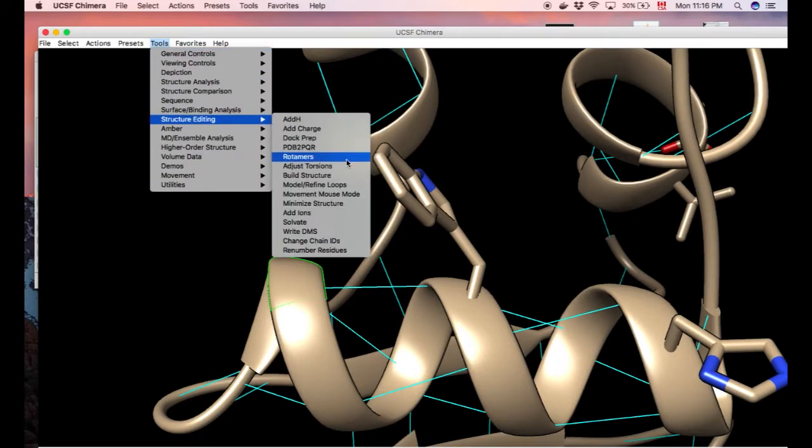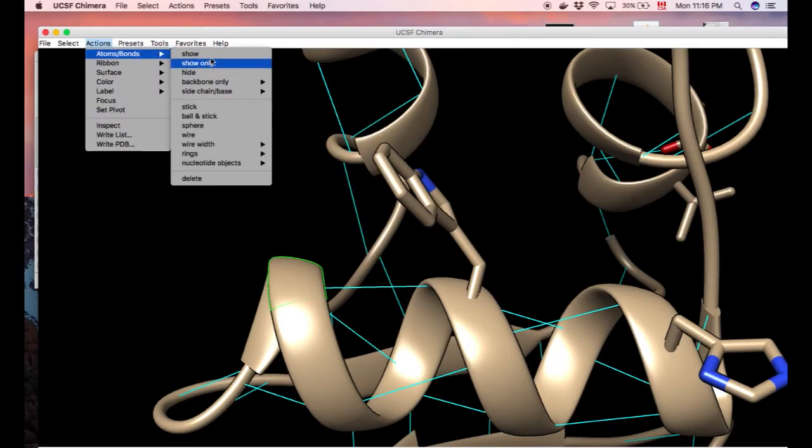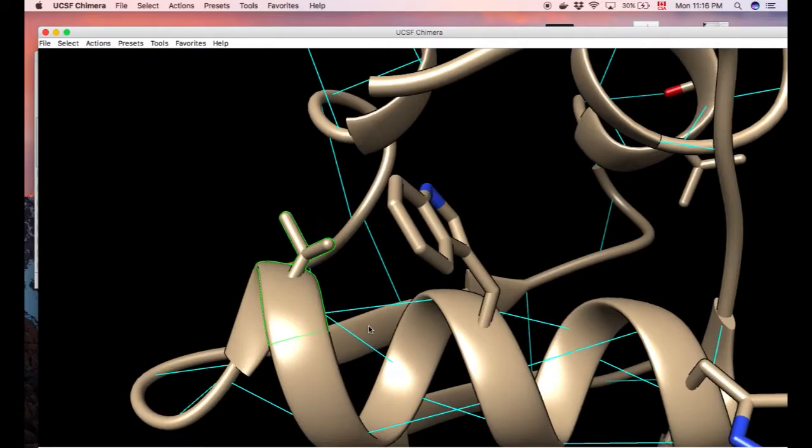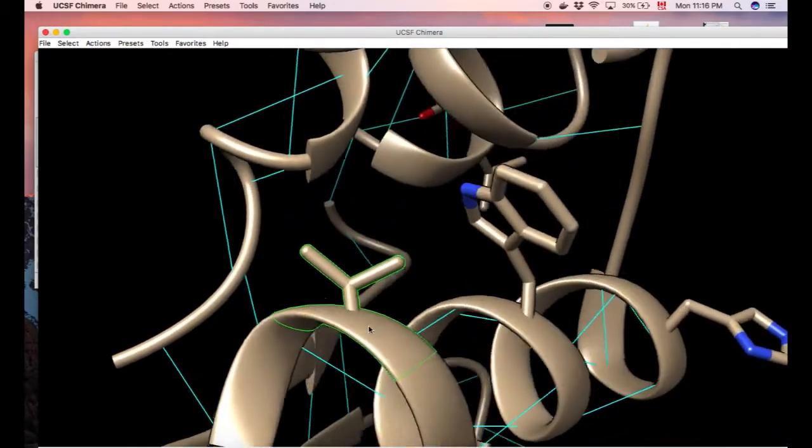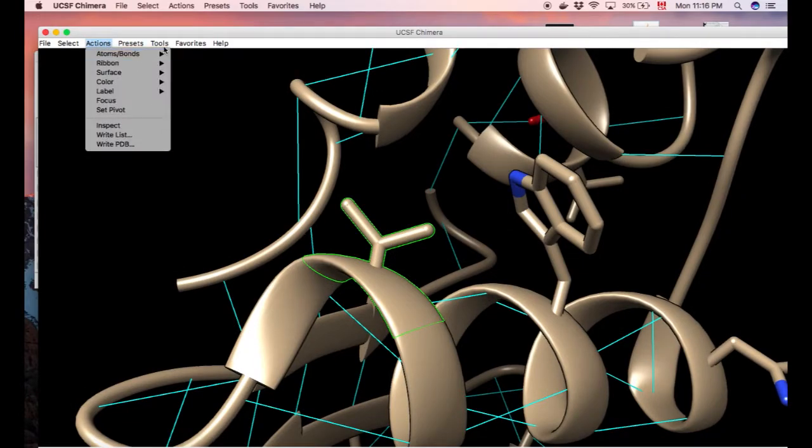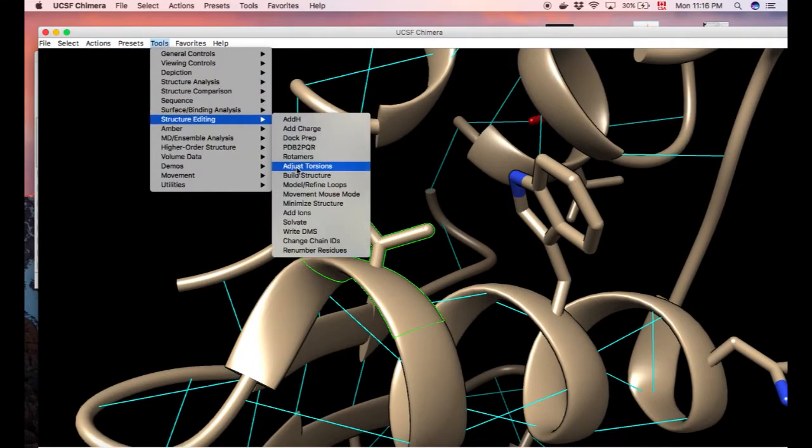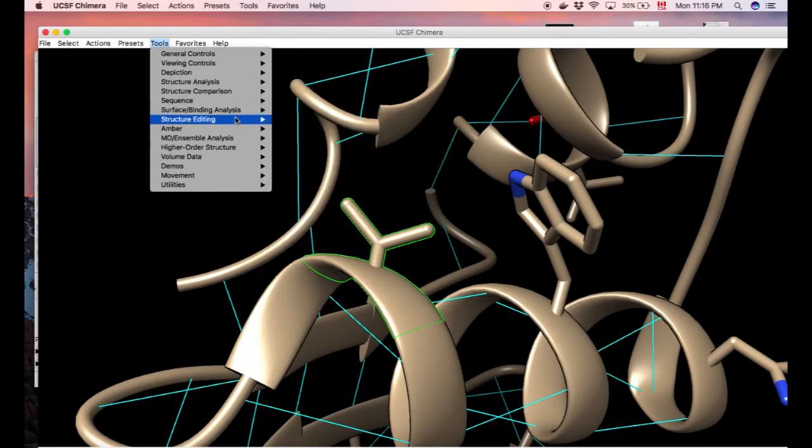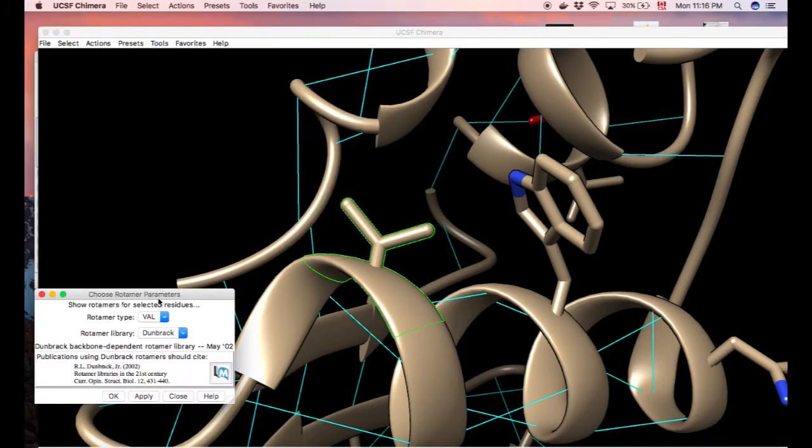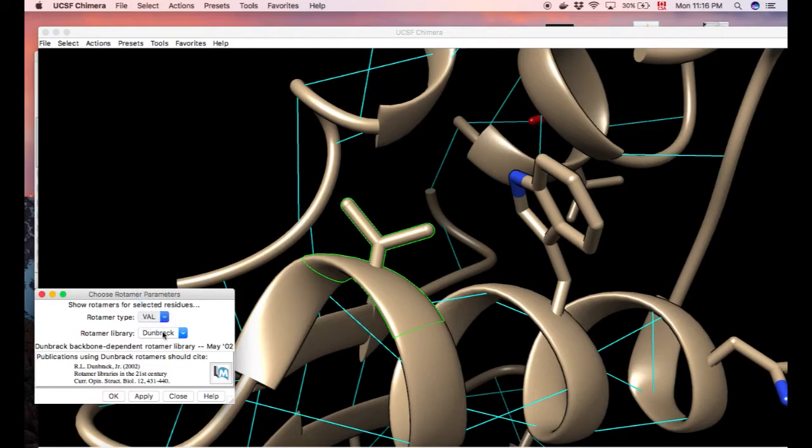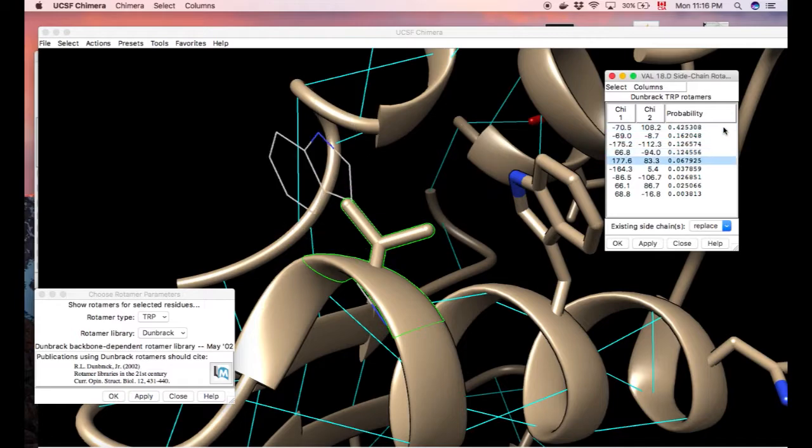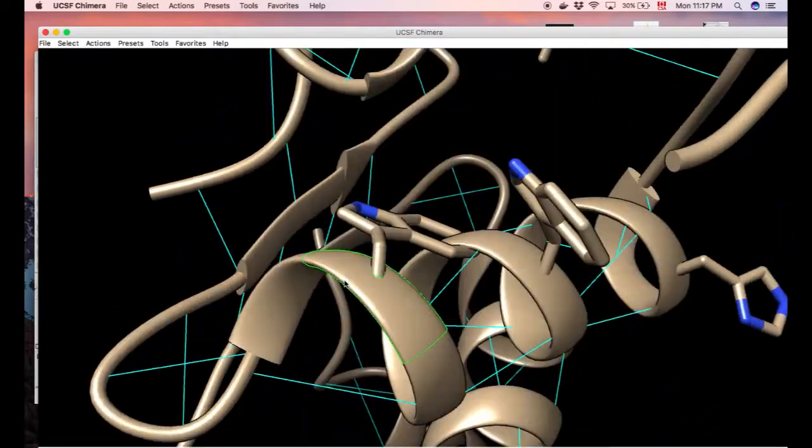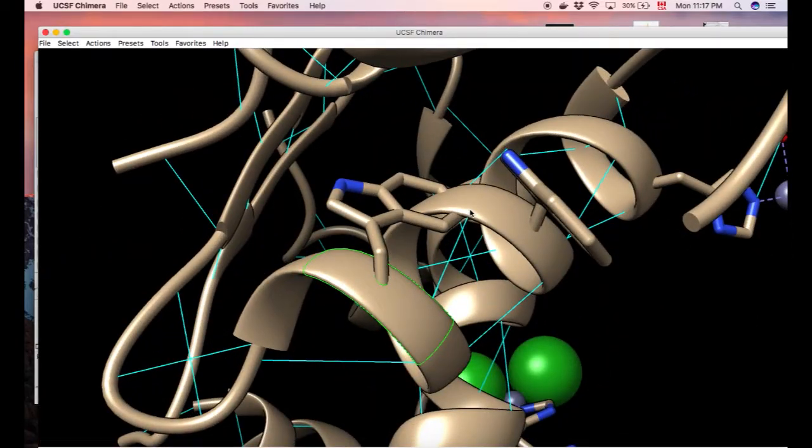Structure editing. We want to show it first. Show. You see it's a quite puny valine. It's not big. It doesn't take a lot of space. Let's try to make it bigger. Larger. To do this Rotamer. Structure editing Rotamer. Valine. We'll show you how to tryptophan. Dunbrack apply. And let's screen for something that causes a big amount of clash. Oh, you have something that actually binds here. Let's apply this. For sure. We're going to have some clashes. Let's analyze this.